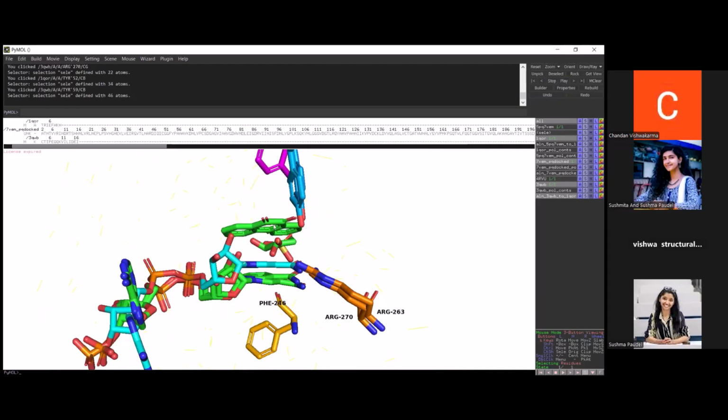And if we don't know this one, 7 VM, what will we do? We will take the sulfate as a corresponding residue. And what is the sulfate corresponding residue? Here also you can get the sulfate corresponding residue, tyrosine 54. So we can say that this one is conserved, but we don't know which one is interacting. But based on the sulfate ion, we can say these are the interacting tyrosine 54. Now we have verified by docking the quinone. We get the tyrosine here. Understood?